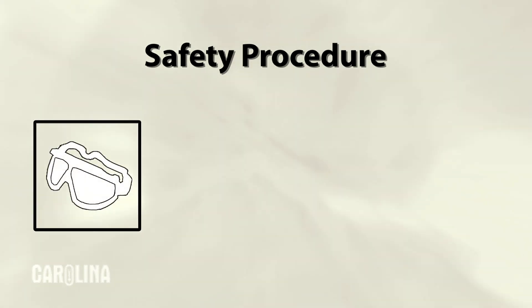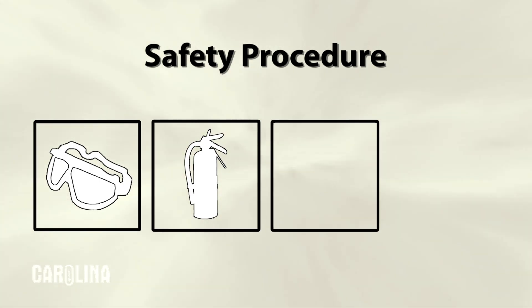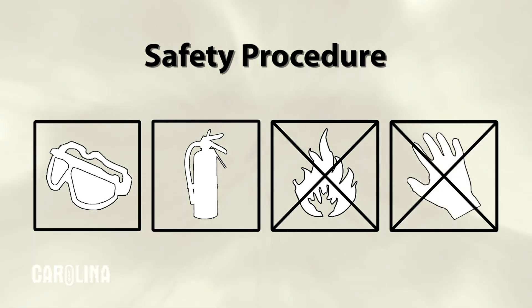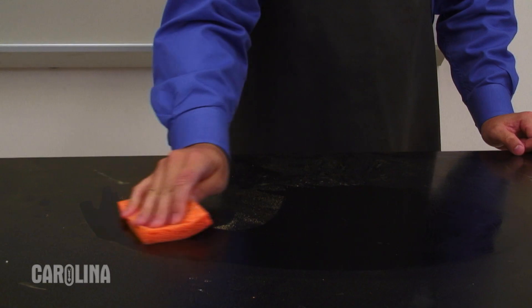For all these demonstrations, it is important to observe proper safety procedure, including wearing personal protective equipment and having a fire extinguisher nearby. While lycopodium burns completely without residue, perform these demonstrations away from other flammable substances. Note that rubber gloves are not worn due to the risk while working with fire. Any unburned lycopodium can be cleaned up with a damp cloth and placed in the garbage.